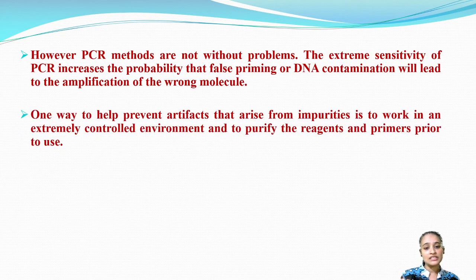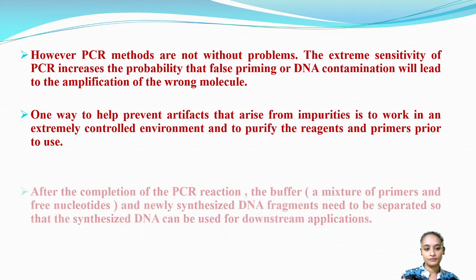One way to help prevent these artifacts that arise from impurities is to work in an extremely controlled environment and to purify the reagents and primers prior to use. So you have to work in an extremely controlled, closed environment away from dust particles, and you need to purify your reagents and primers before you go for PCR.